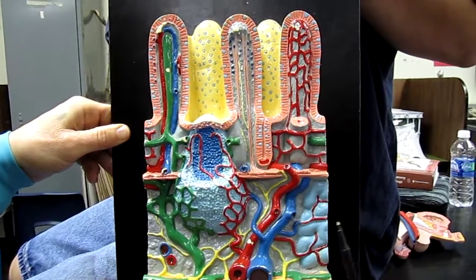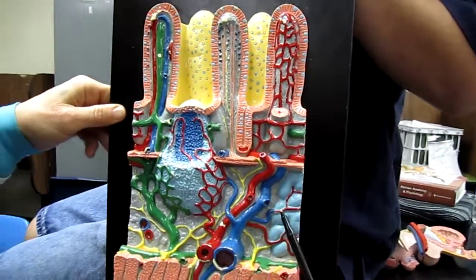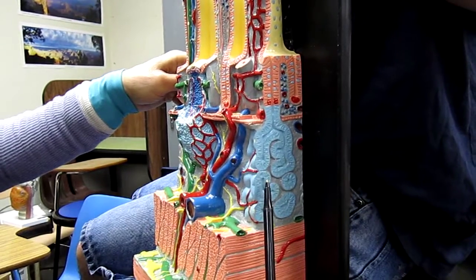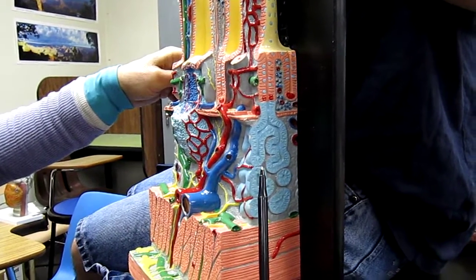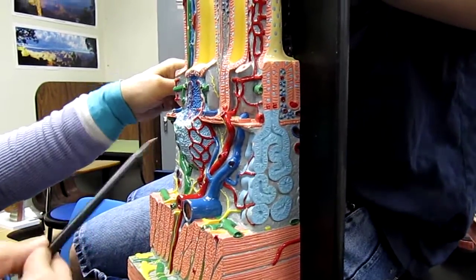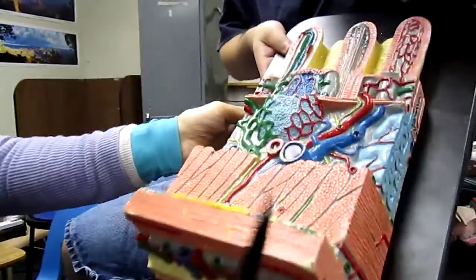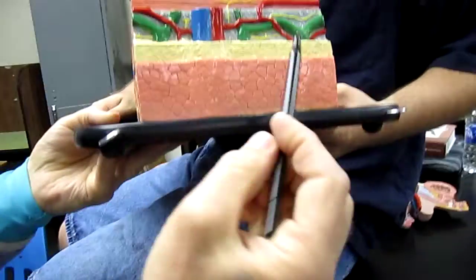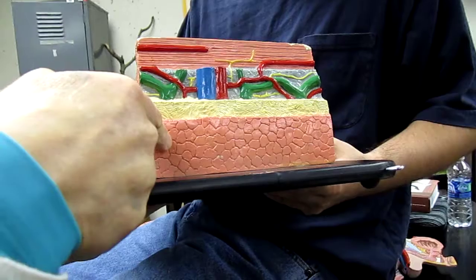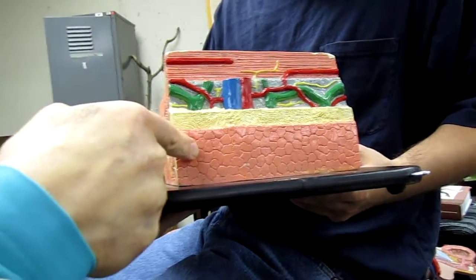Then notice that over on this side we're going to have the Brunner's glands, which are going to secrete mucus into the intestines. And notice that on this very underside here, we actually have simple squamous epithelium, which means that is going to be the visceral peritoneum.